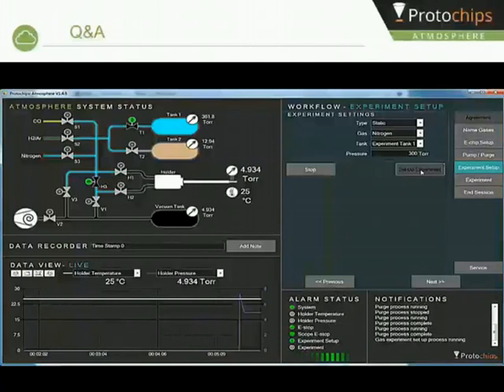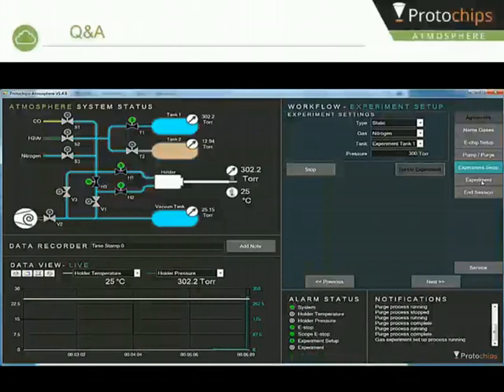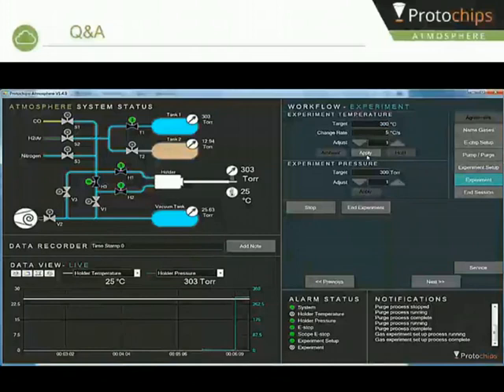Okay, thank you. Another one for John on the system again. How easily and quickly can the holder be loaded, and how difficult is it really? In short, it's pretty easy. Our primary focus when designing the holder was ease of use. We've designed the holder so that it quickly creates and maintains a hermetic seal. The holder that we're selling now is our fourth generation gas cell holder, and with each generation we've made it easier to use. Like any microscopy tool, it takes some practice to learn how to use it and optimize your technique, but loading generally takes just a few minutes.